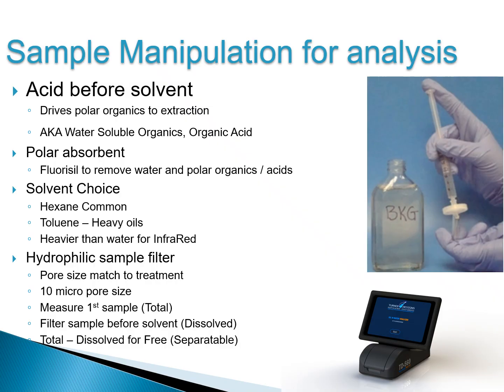There are many different ways to manipulate a water sample to produce data that is helpful for operators or engineers commissioning water treatment systems. Most of the time, an operator will develop a method that works best for their process and their purposes and standardize on it. But in some cases, to glean just a little bit more information about what's happening in the process, the sample preparation procedure can be changed.